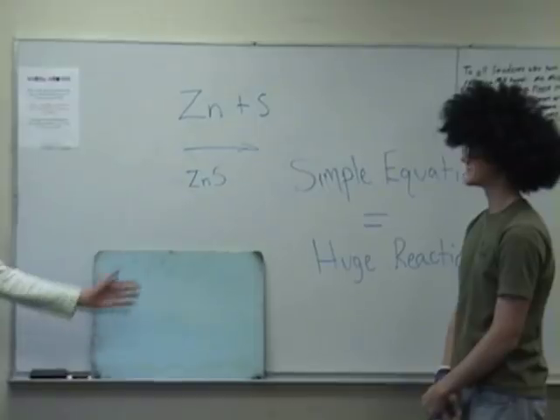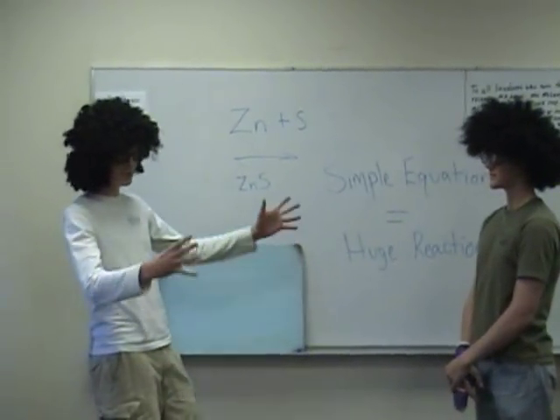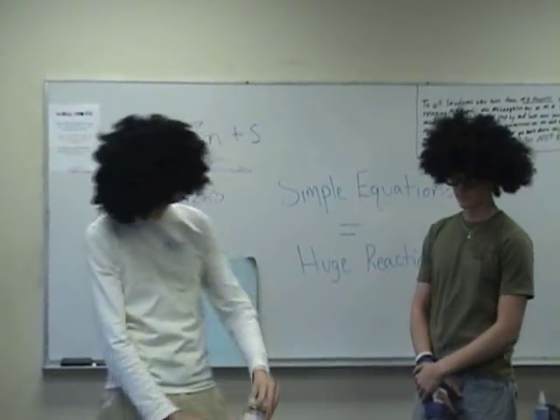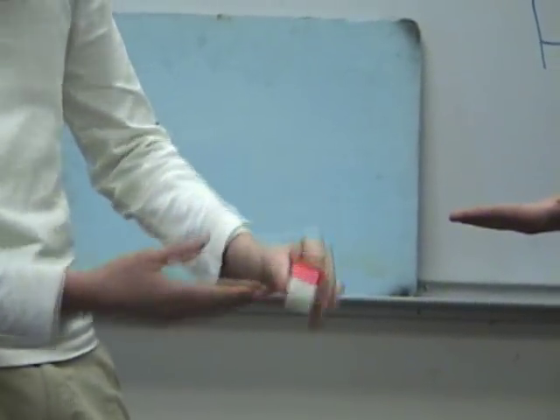Today, for our last experiment, we are going to do something quite explosive. Very explosive. We are taking zinc powder — looks like this — plus sulfur, which is a yellow element.